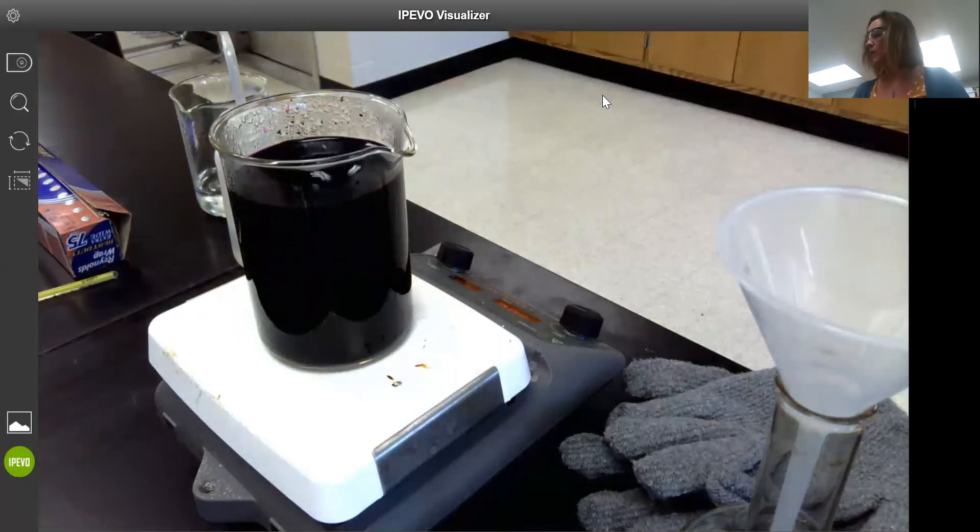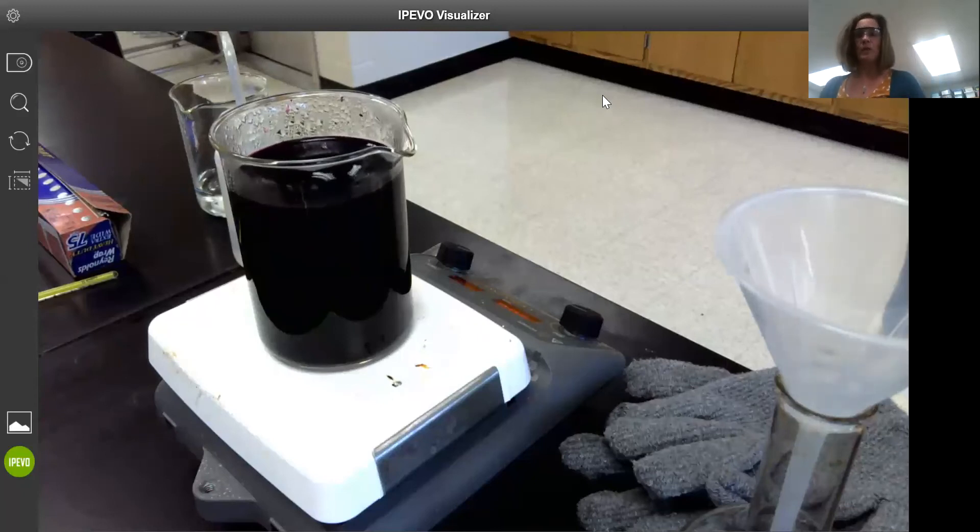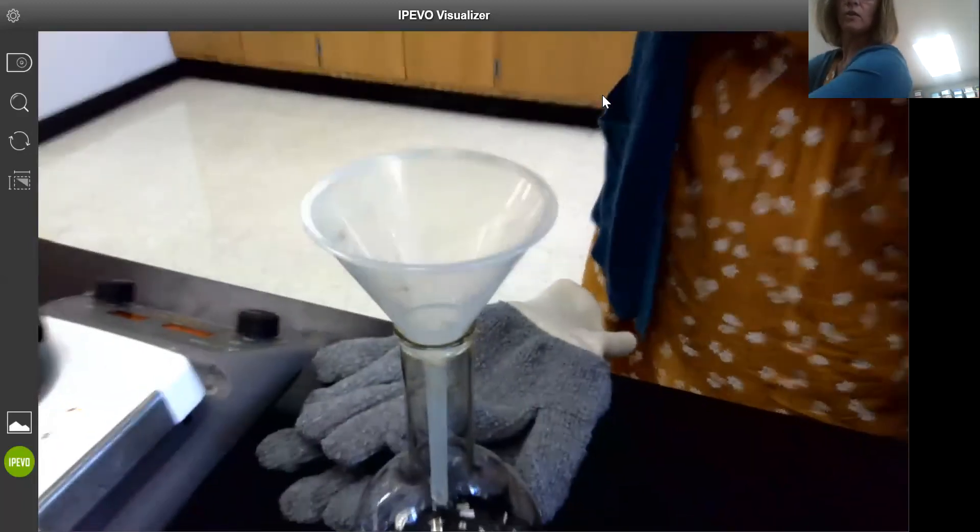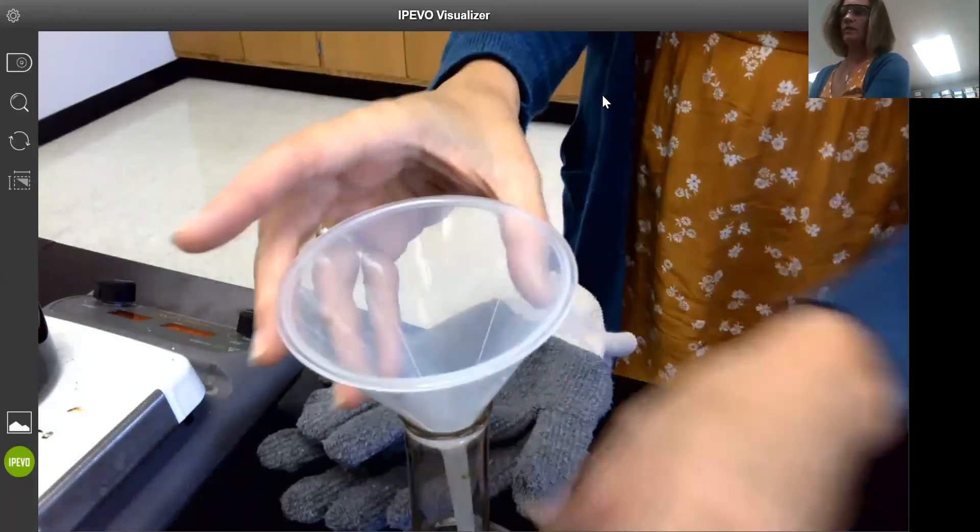Now the next thing we're going to do is transfer the KMnO4 solution into a flask for storage, and this will be the solution that we use to do all of our titrations. I'm going to show you the storage flask next.